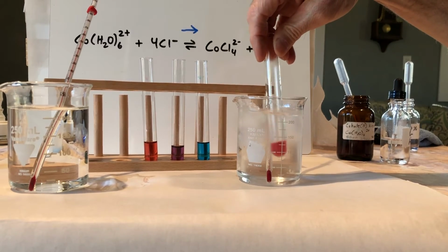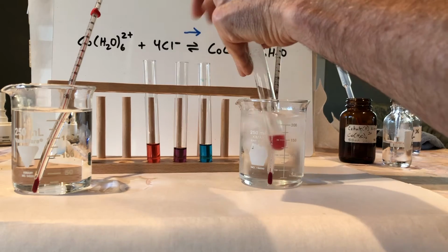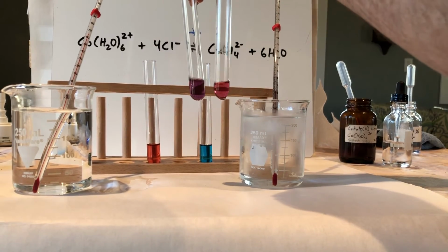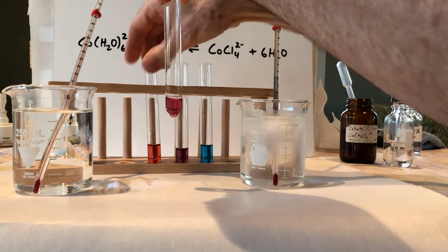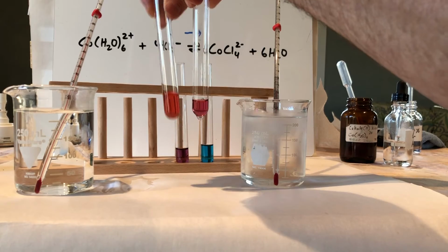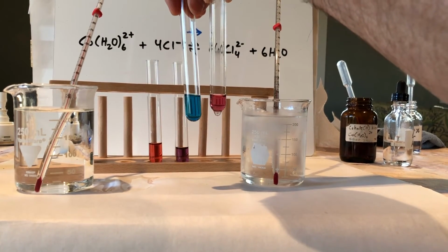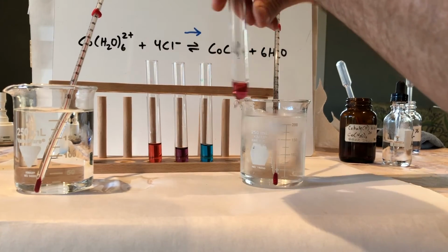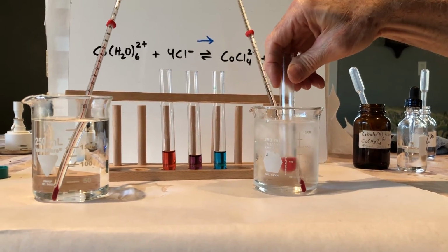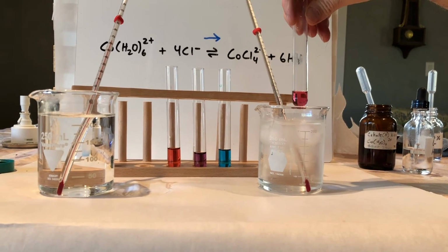And I think we've probably gone far enough to where we can compare this solution to our original purple, and then the pink of the Co(H2O)6 2+ solution, and the blue of the CoCl4 2- solution. So it's not fully pink yet, but it's pretty close. It's definitely headed in that direction. And so that is it.